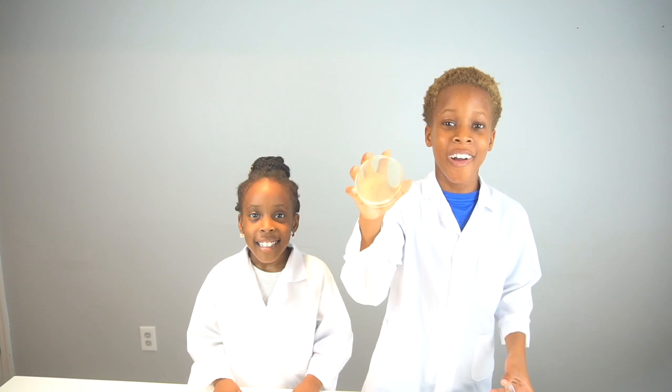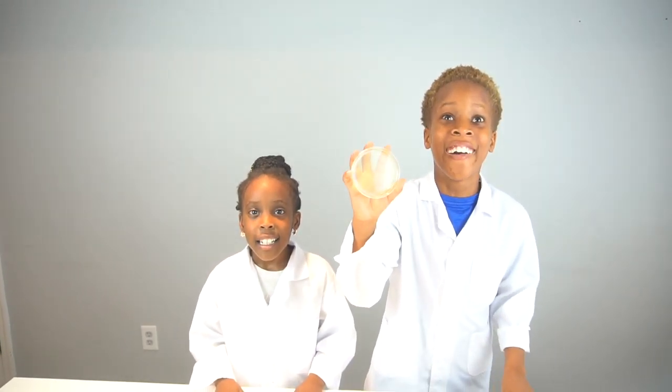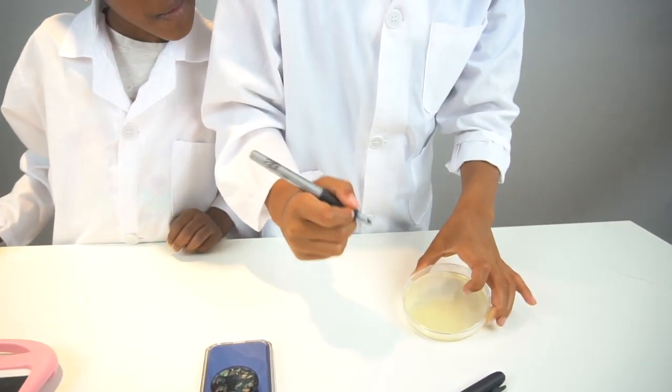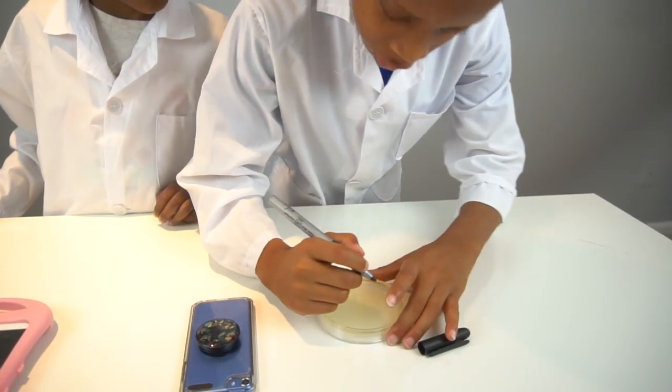Do not touch the agar with your finger, because if you do it's going to be contaminated with the bacteria on your finger. Before you start the experiment, make sure you wash your hands. First we're going to label what we're testing — it's better to label it on the bottom, in case the top gets mixed up.